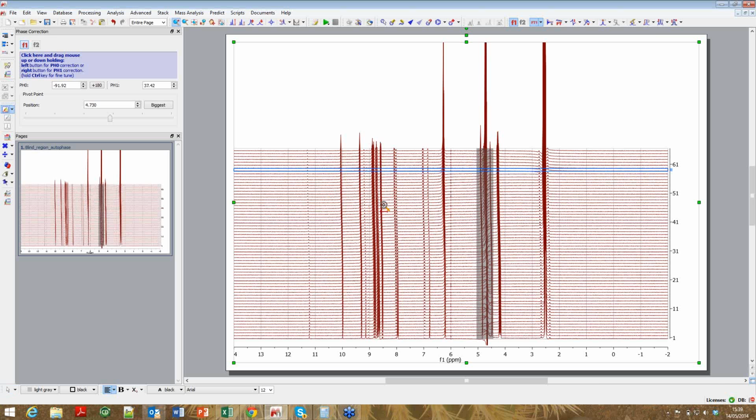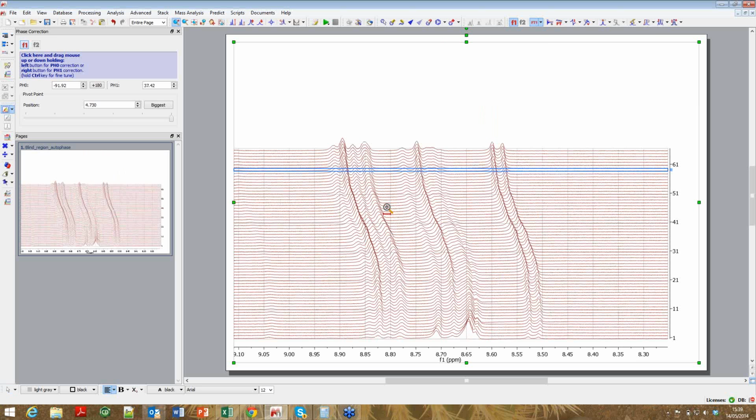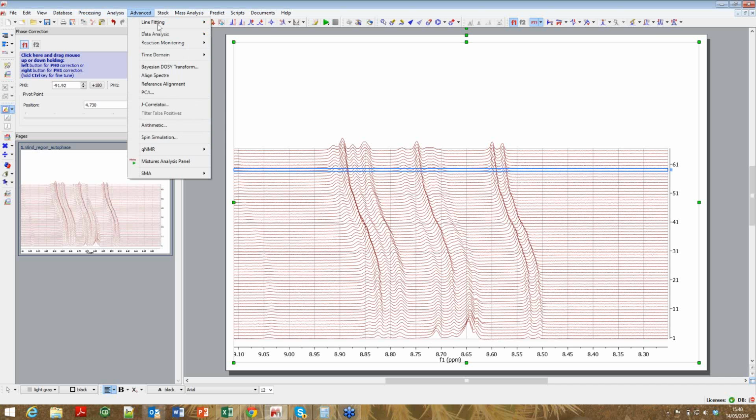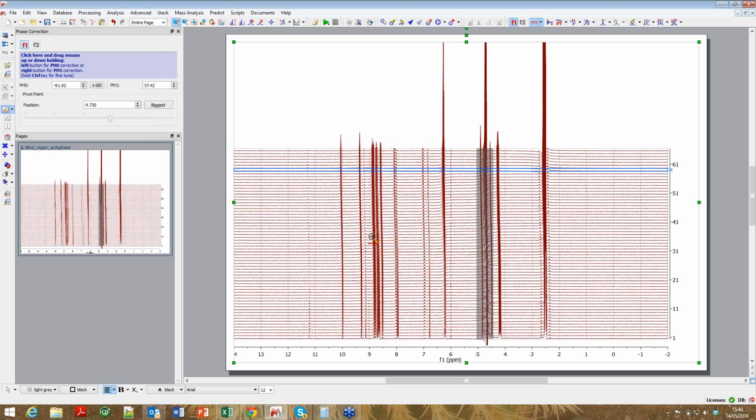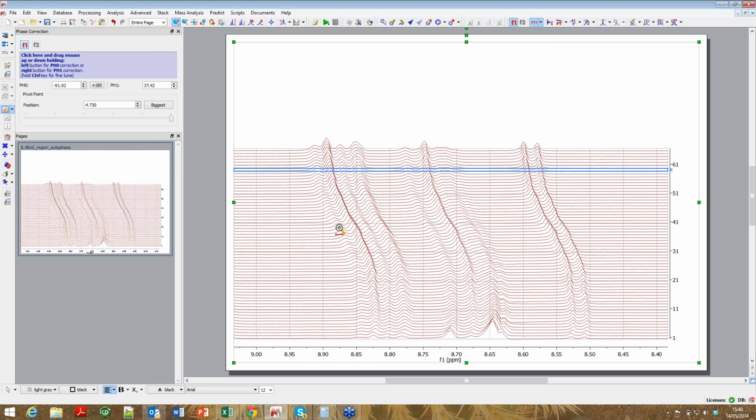So let's see now. So again, I come to this point about selecting regions. If you wanted to integrate these three regions here, you would certainly need something better. An automatic tool wouldn't work for you. But I also want to talk a little bit about different ways of integrating. And although these data aren't perfect for illustrating it, I'll do it anyway.